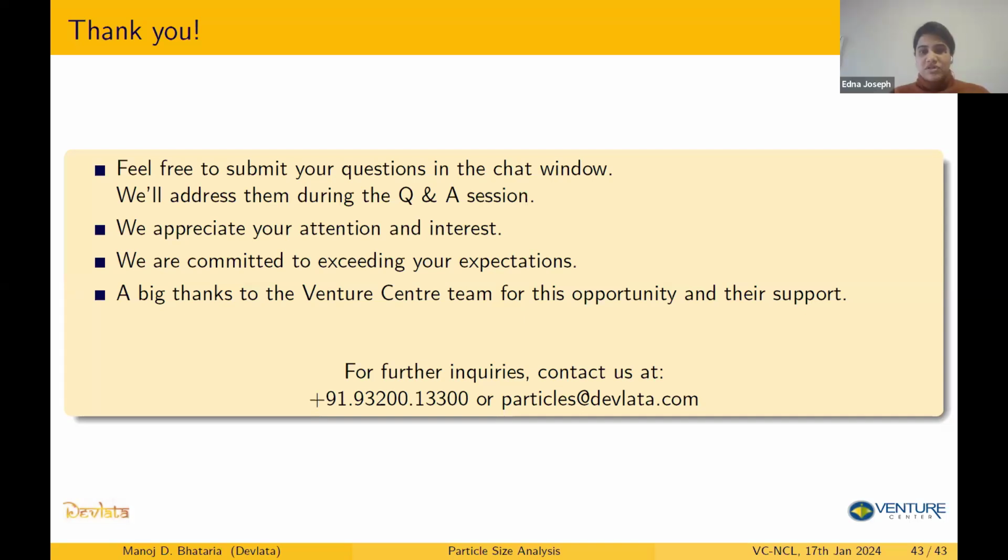Sure. So I think before the real experiment, it will involve a couple of experiments to even come to the right concentration.